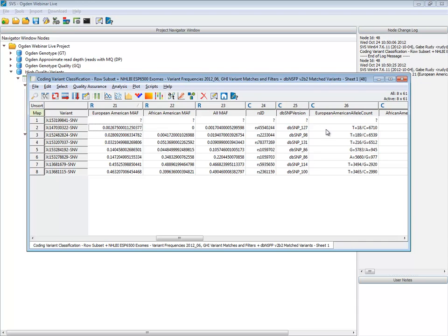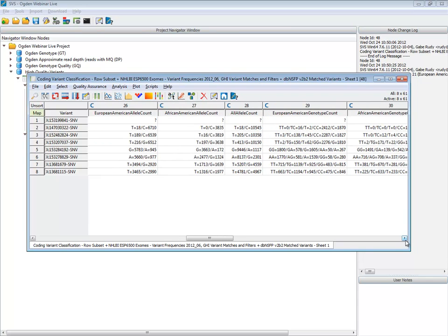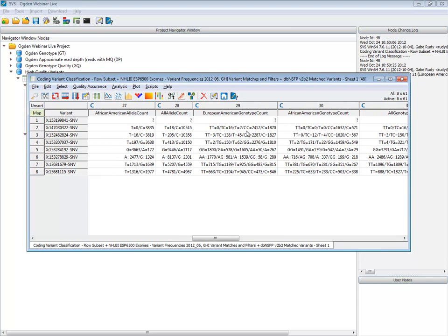But as we scroll over and look at those genotype counts, this is the genotype counts. So the reference here is a C, and notice again the hemizygous genotypes are going to be the ones from males where there's only one allele. Just as I was mentioning earlier, females are going to have 2 alleles in the X chromosome. So there are a lot of people, 1,870 males in this cohort that have a C, but there are 2 that have the variant here.